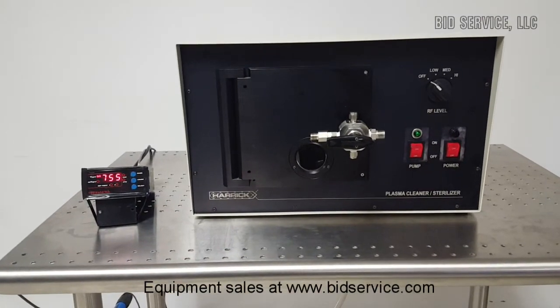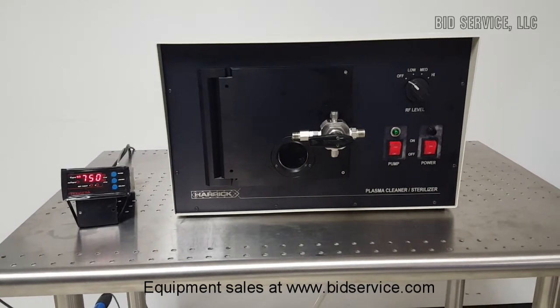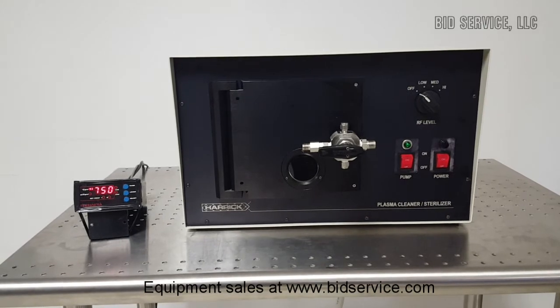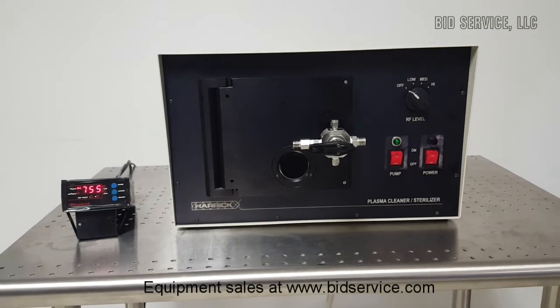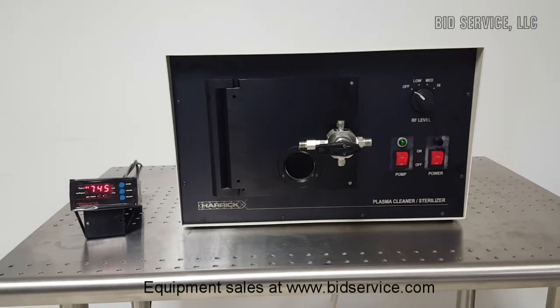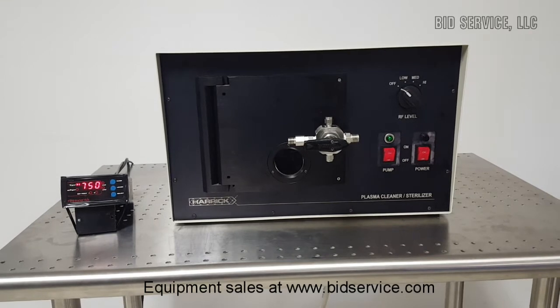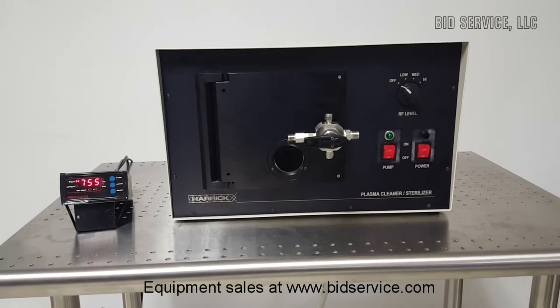The Hardrick Scientific PDC-001 Expanded Plasma Cleaner has four times the capacity of the Basic Plasma Cleaner. This compact tabletop unit with adjustable RF power settings has a maximum RF output of 30 watts. It includes a Pyrex chamber that is six inches in diameter by six and a half inches long, an active fan for cooling, an integral switch for the vacuum pump. This unit does not come with the vacuum pump. It is powered by 110 volts and draws 1.8 amps.